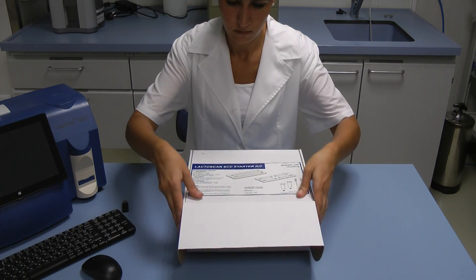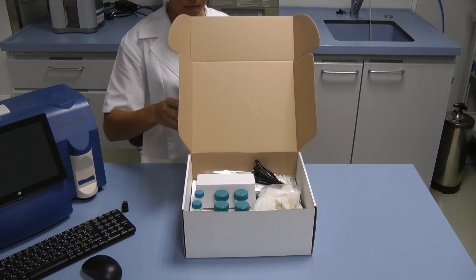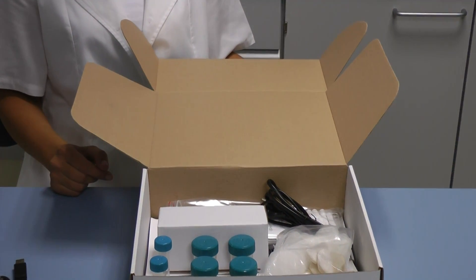Hello, in this working video we are going to show you how to prepare and make analysis of samples with the LectoScan Somatic Cells Counter in few easy steps. Please make sure you have read the instruction manual before you start working with the device.